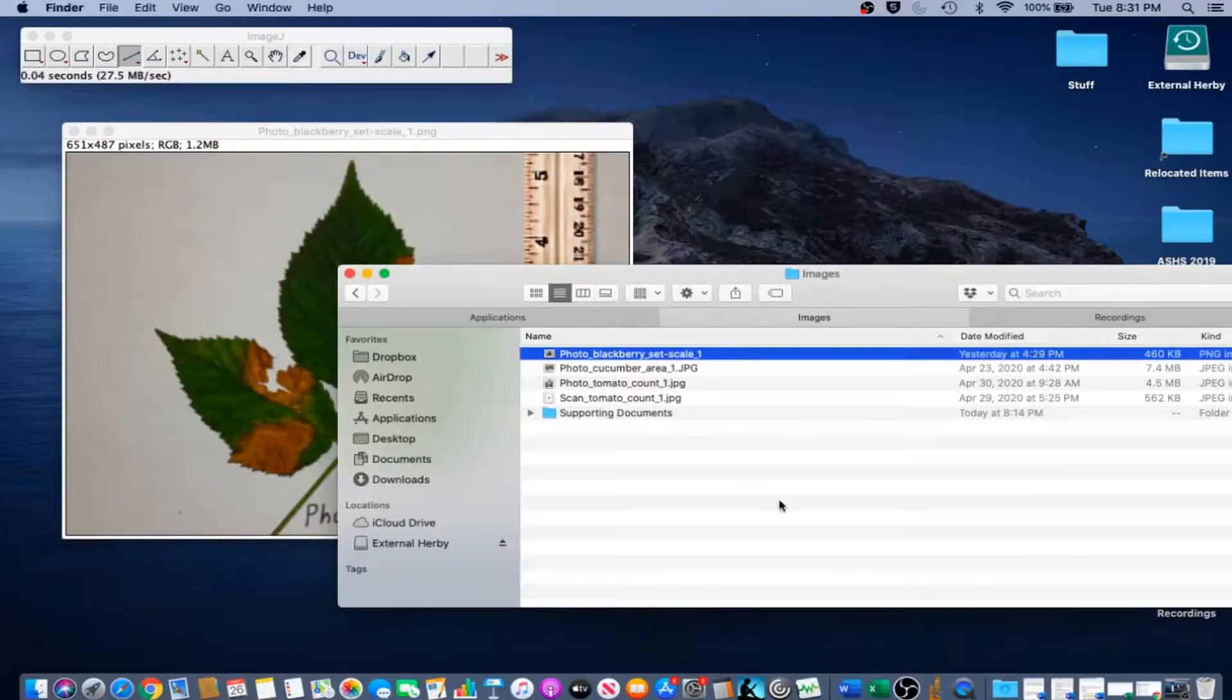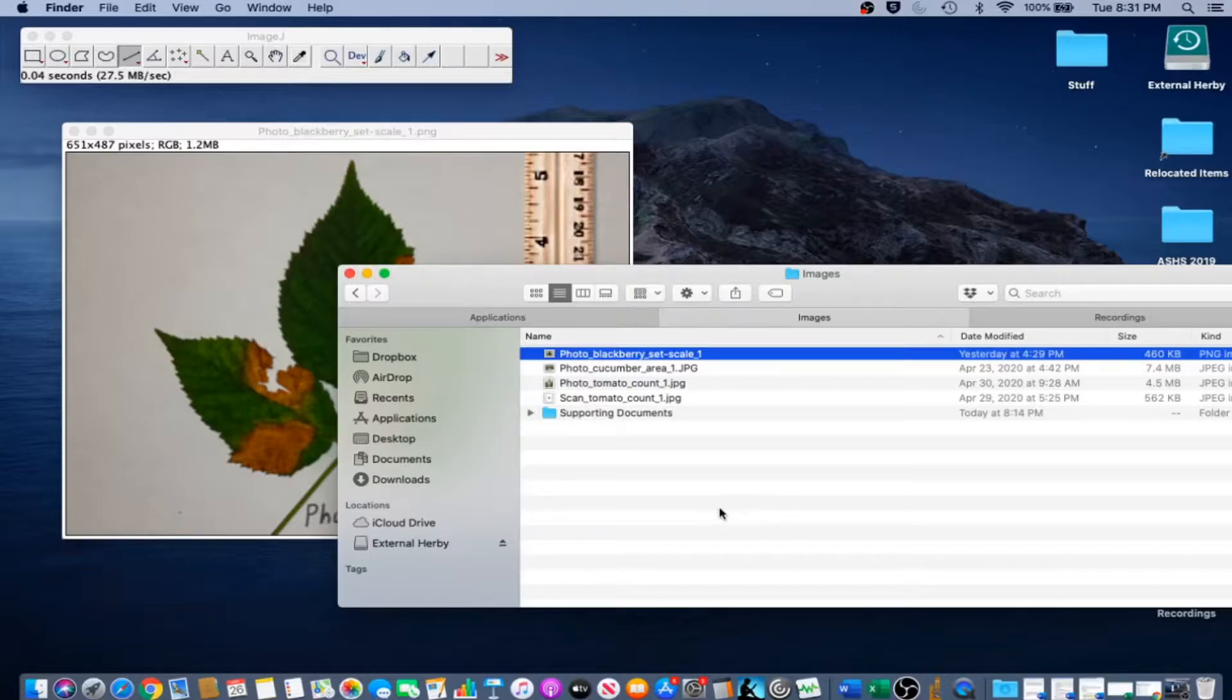On many computers you can also drag the image onto ImageJ's graphical user interface and the file will open.